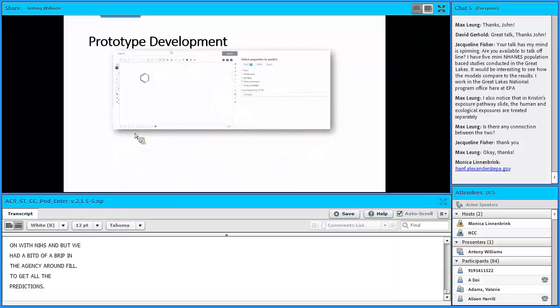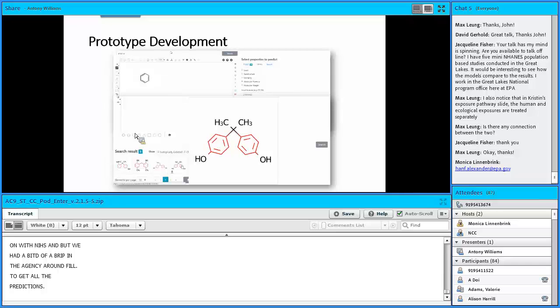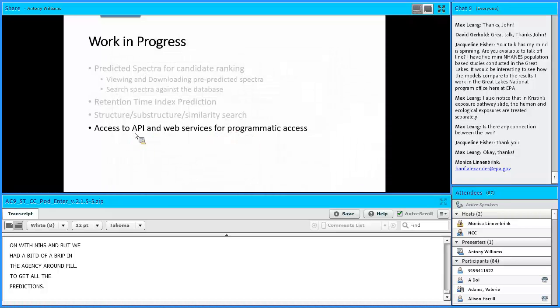So here's an example. But for mass spec specifically, if you're looking at a mass spectrum and you know specific substructures, you could add a number of those substructures in as known entities in the chemical, add the formula, and then it would use the combination of substructural fragments and formula to bring up specific chemicals. So this is going to be the chemical forensics aspect of the search.